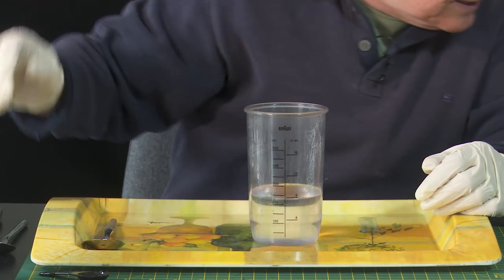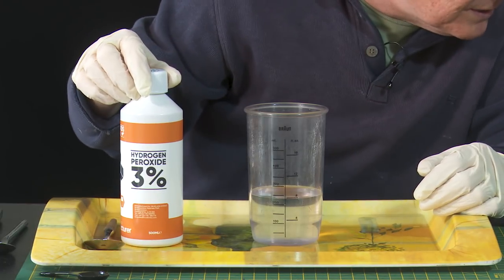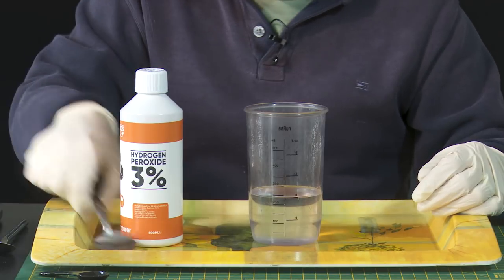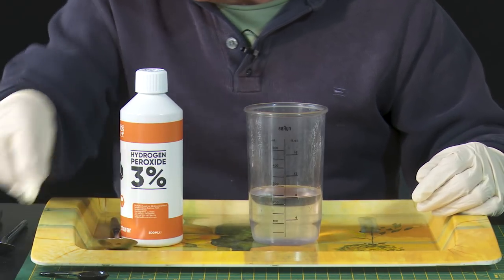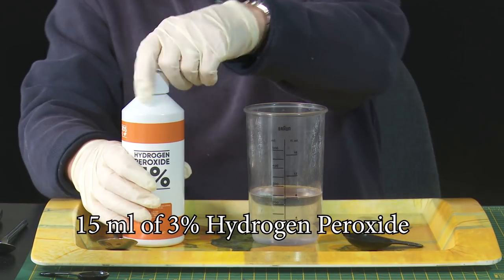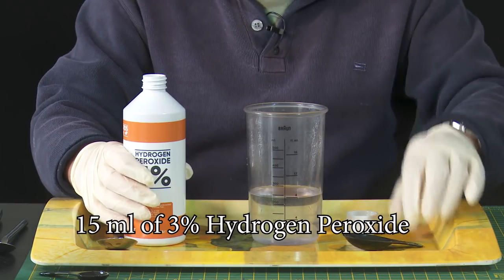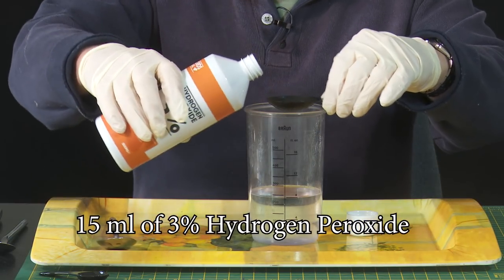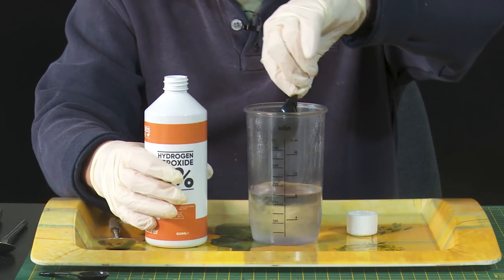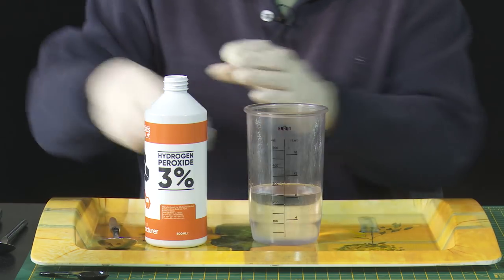The next thing I need is hydrogen peroxide, and the quantity required is — very complicated this — a tablespoon. A tablespoon is also 15 millilitres, so I'll pour out 15 millilitres of hydrogen peroxide and pop the lid back on.